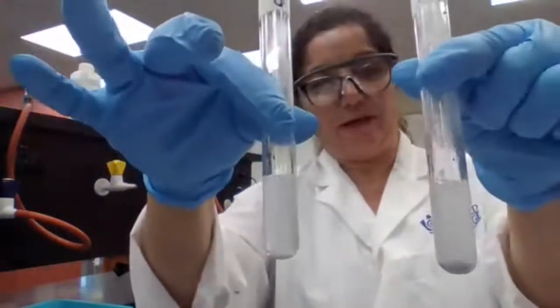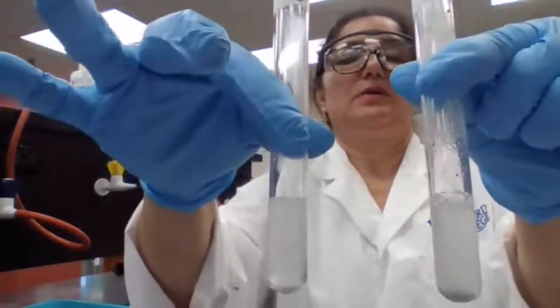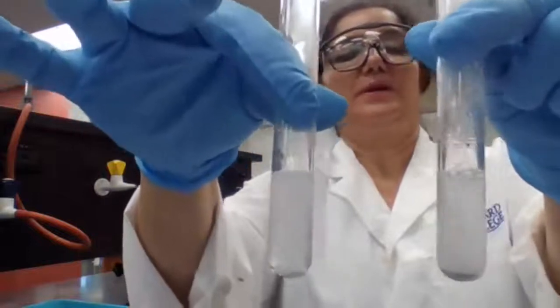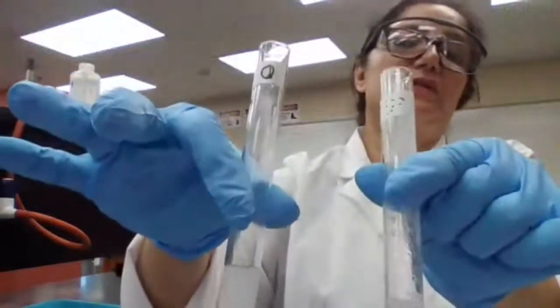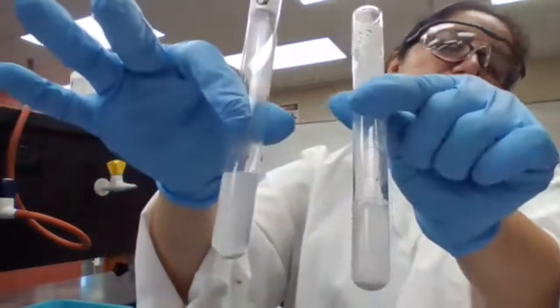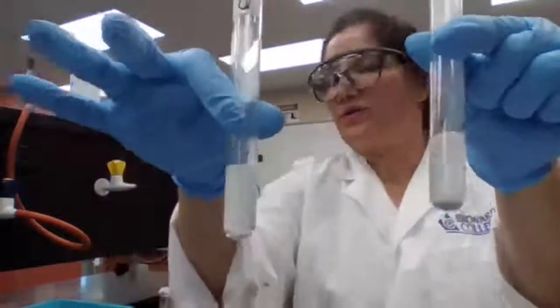That's all it's asking for now. Doesn't say to time it. It doesn't say to wait until completely done, but just compare the two, the granular versus the zinc shot. Faster formation of bubbles, faster reaction.